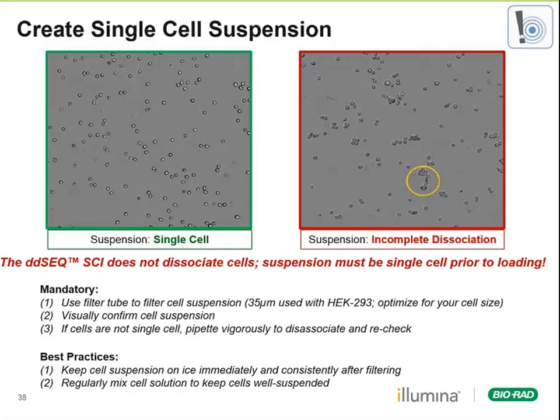One final note, if you've never tried to achieve a single cell suspension or you're looking to use new cells, here would be a great place to optimize your cell culture before you look to do your first preparation.